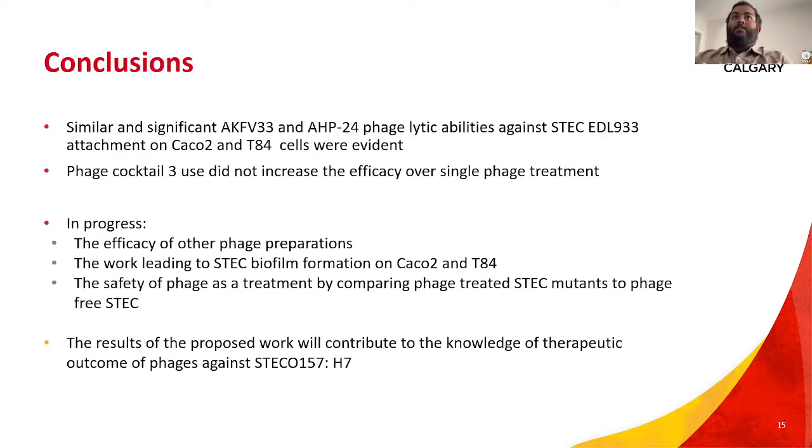To conclude, we were able to establish a proper visual representation of STEC attachment onto the CACO2 and T84 cells, and then for our phage treatment, we saw AKFV33 had better phage lytic abilities against STEC EDL933 attachment on the CACO2 and T84 cells than phage cocktail 3.